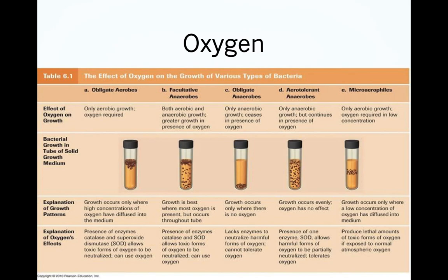So what you do is you take a petri dish of pure culture bacteria, and then you take a brand new test tube with a nutrient agar inside of it, nutrient gelatin inside of it, solid media. What's going to happen is the bacteria, once you introduce them into this tube, are going to move around inside of the tube to find the amount of oxygen that they like.